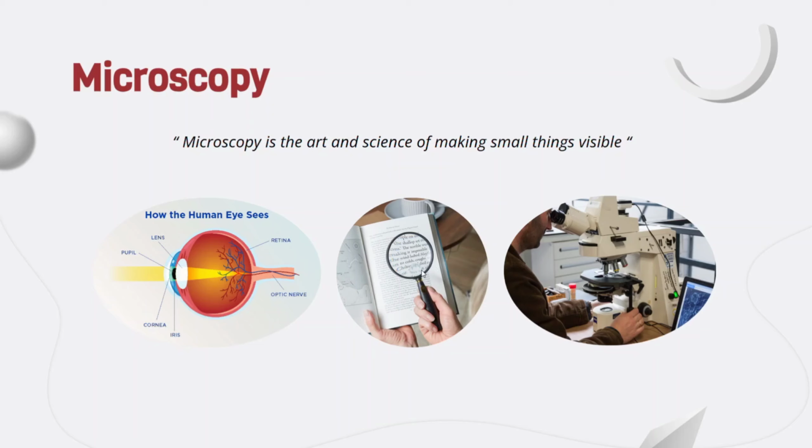A standard light microscope is made of the light source with a diaphragm to change the amount of light, and condenser lenses, which are optical components located below the stage to focus and concentrate light onto the specimen, providing uniform illumination and enhancing clarity and contrast of the image. The stage, where we place the specimen, can be moved to see different parts of the sample. Objective lenses are located near the specimen, normally 3 or 4 in a revolver, to choose the best one for your specimen.